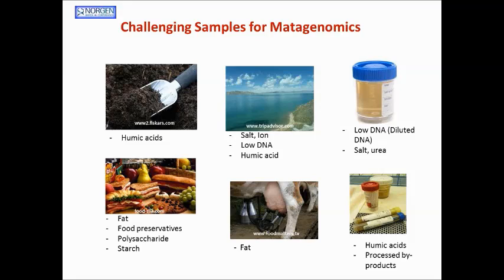This fact hasn't changed for many decades, which explains how DNA extraction has become a fundamental and critical job, despite the fact that more and more sophisticated downstream applications are exponentially available nowadays.